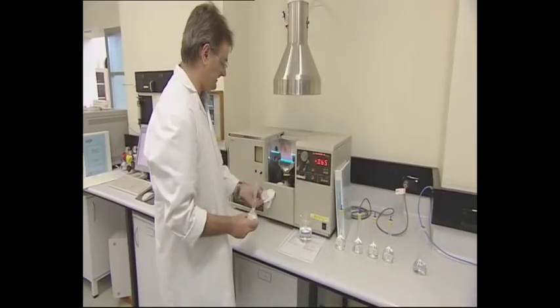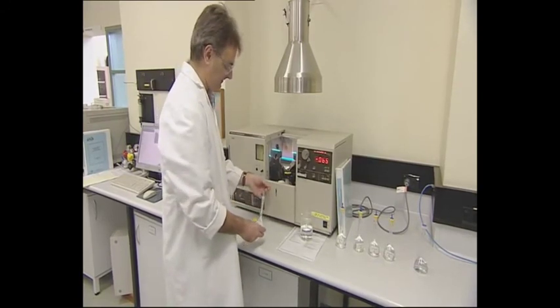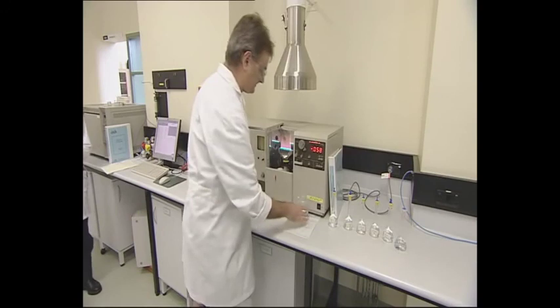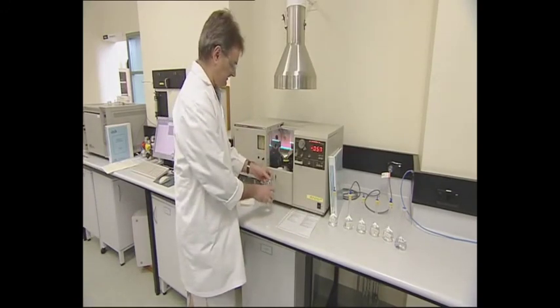This is our dissolved up sample prepared fish, now in solution, giving a reading of 0.27. And after we've finished all the solutions, we need to clean out the internals of the instrument by flushing it with some more dilute acid.